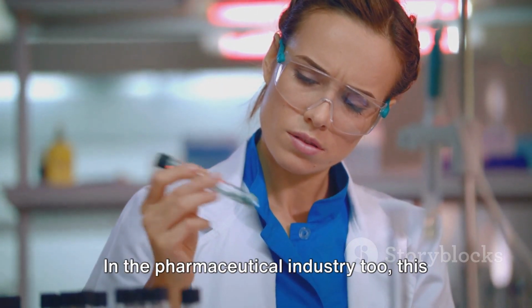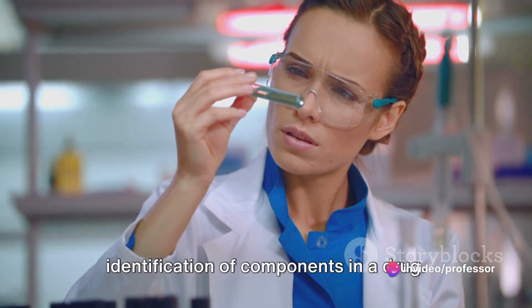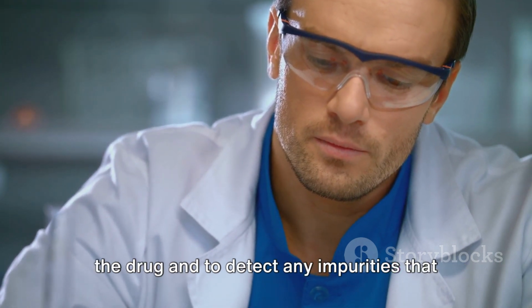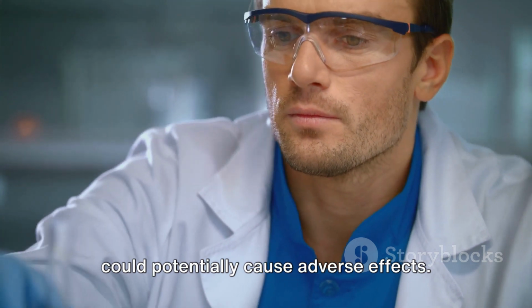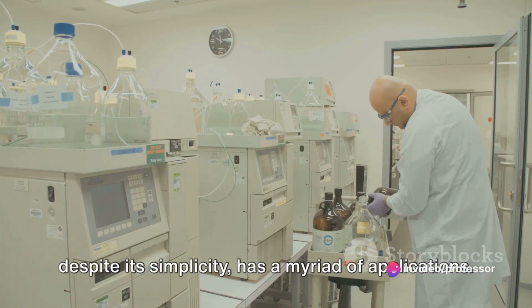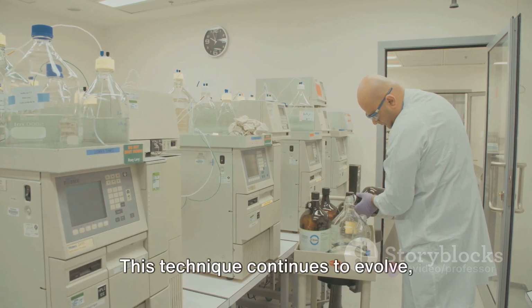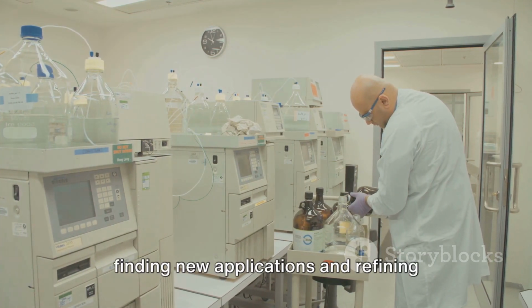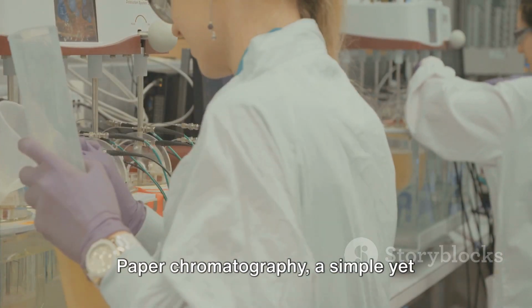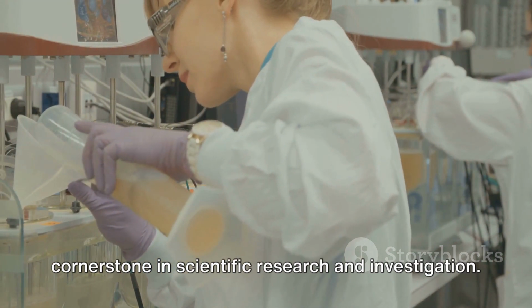In the pharmaceutical industry too, this technique is widely used. It helps in the separation and identification of components in a drug. This is crucial to ensure the efficacy of the drug and to detect any impurities that could potentially cause adverse effects. As you can see, paper chromatography, despite its simplicity, has a myriad of applications. It's a testament to the fact that sometimes the simplest tools can be the most powerful. This technique continues to evolve, finding new applications and refining existing ones. Paper chromatography, a simple yet powerful tool, continues to be a cornerstone in scientific research and investigation.